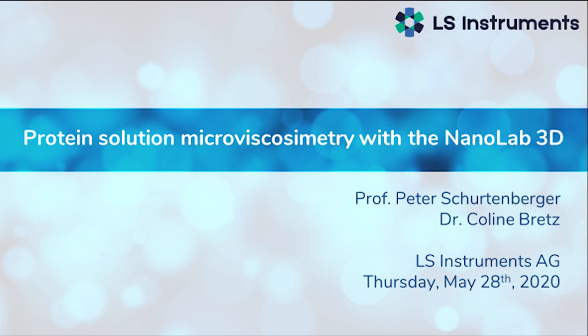In today's event, we will be talking about protein solution microviscometry with the NanoLab 3D.